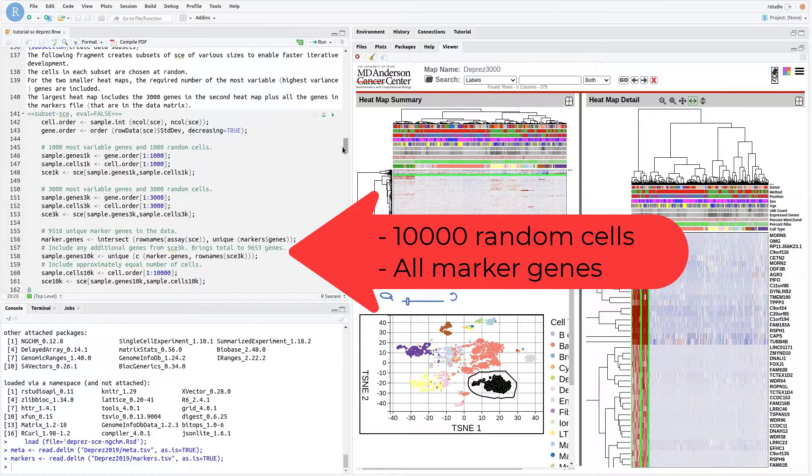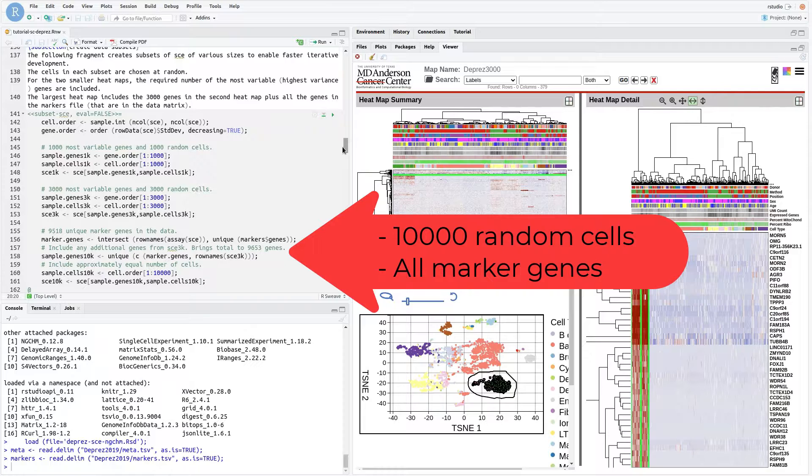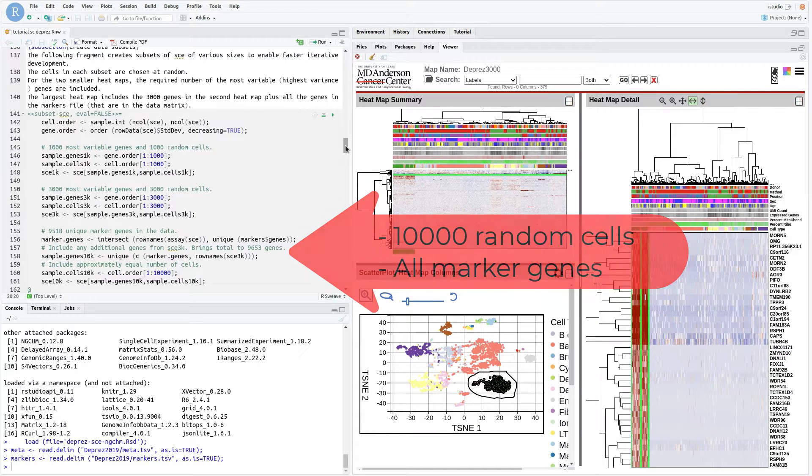The third contains 10,000 randomly selected cells and all the unique marker genes in the file provided by Dupre et al.